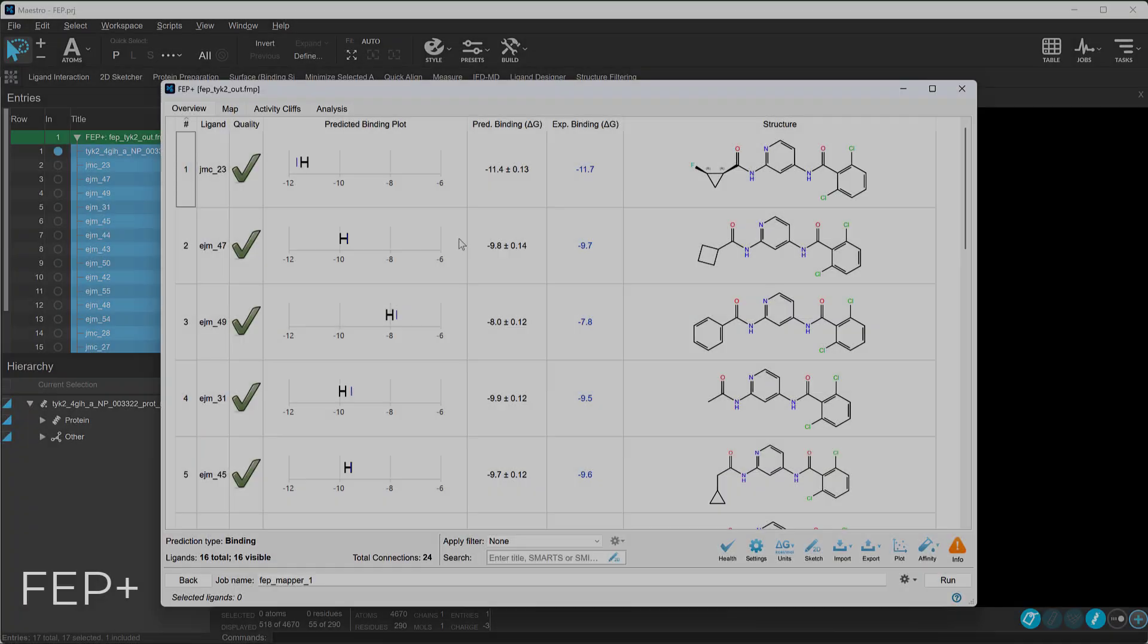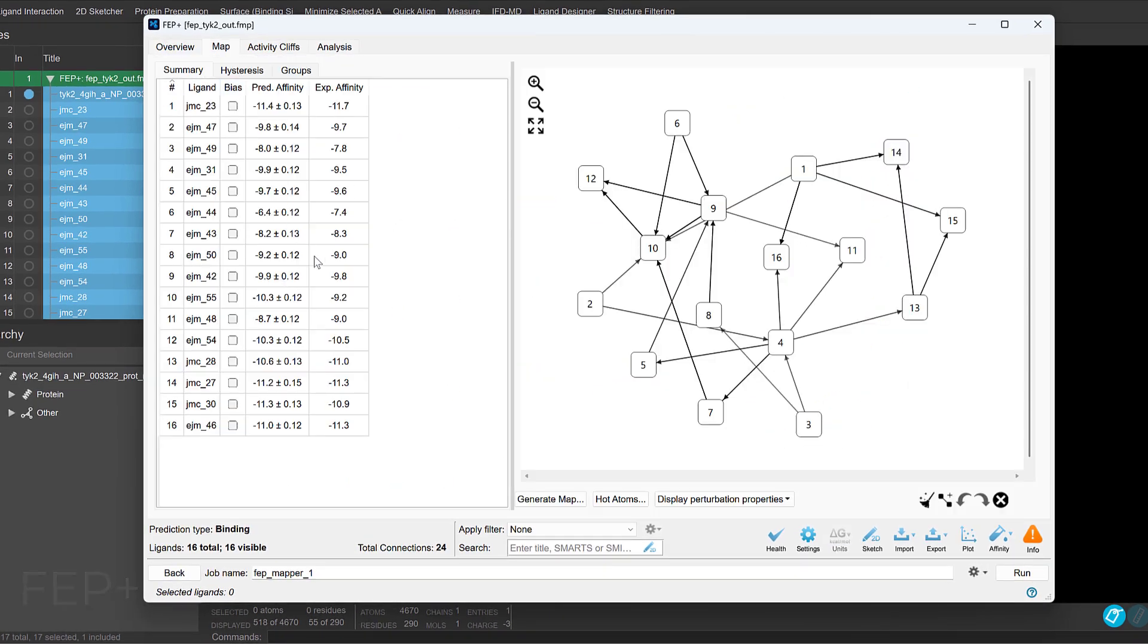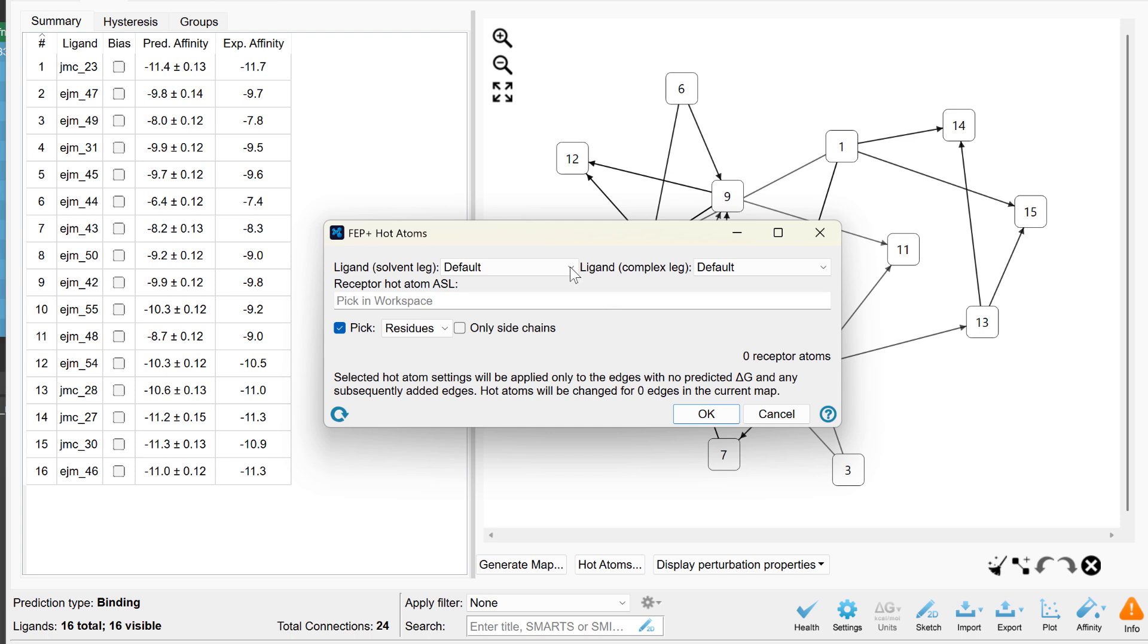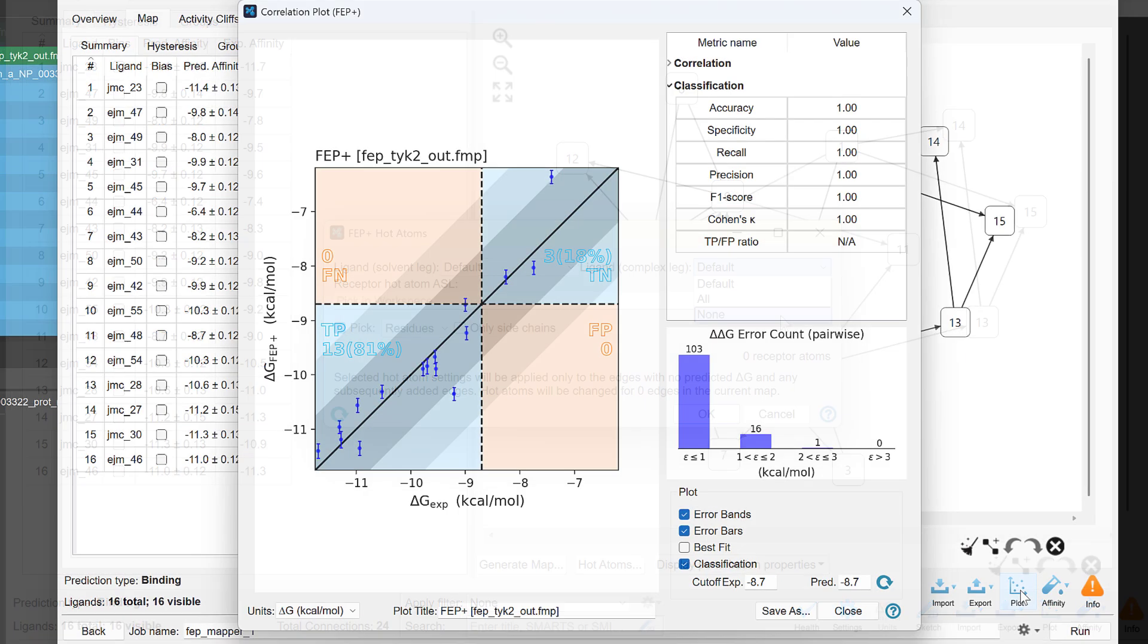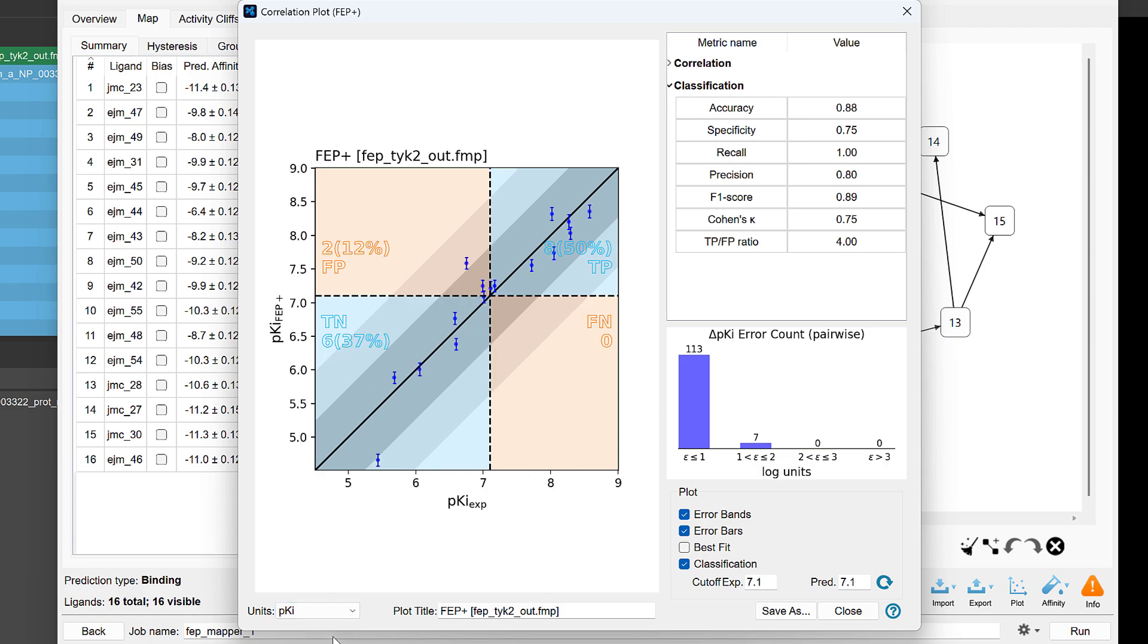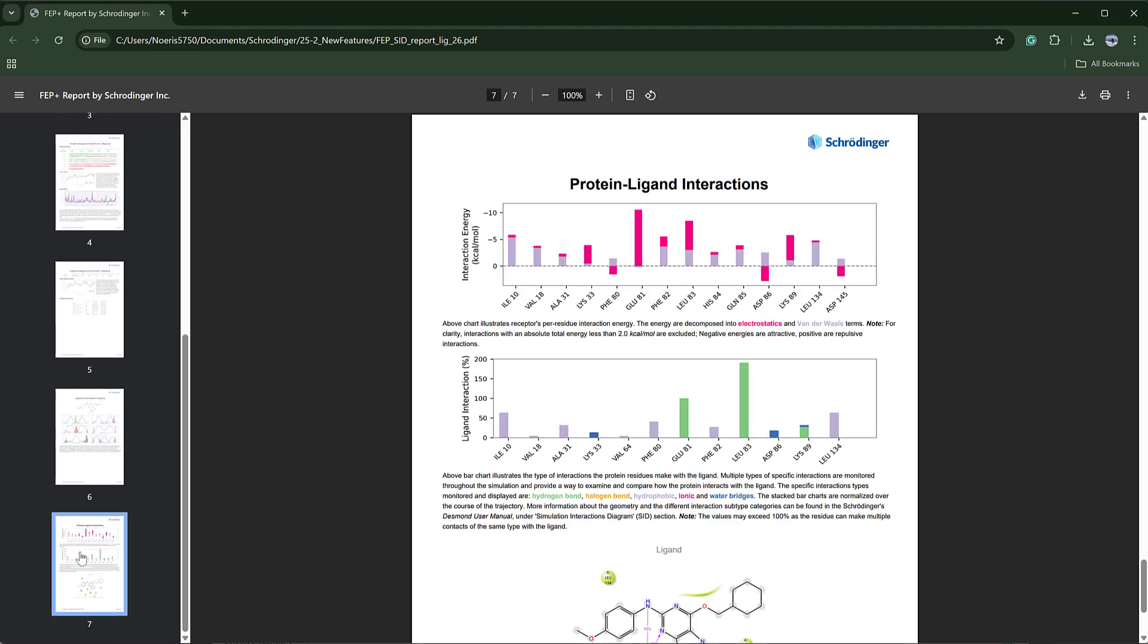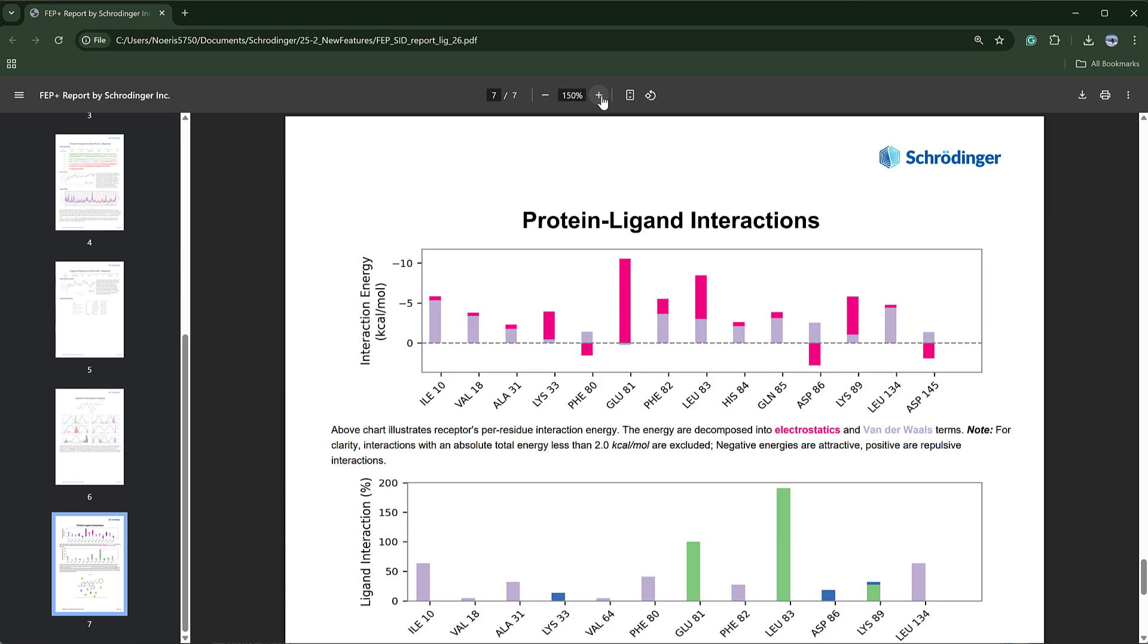The main FEP Plus panel also sees usability enhancements. Selecting ligand hot atoms now offers finer control, featuring separate drop-down menus for the solvent and complex legs, along with a new option to specify none. The classification matrix layout and styling have also been refined for improved clarity, and for absolute binding FEP Plus calculations, detailed energy decomposition data is now included in the EDGE analysis PDF report.